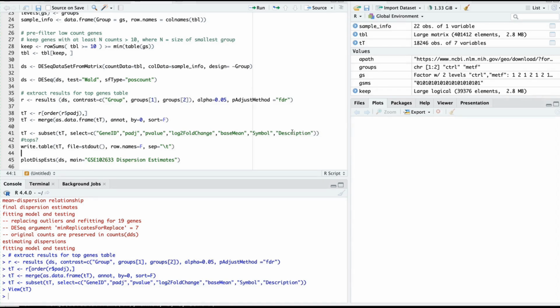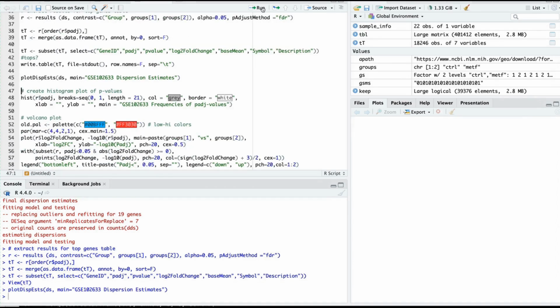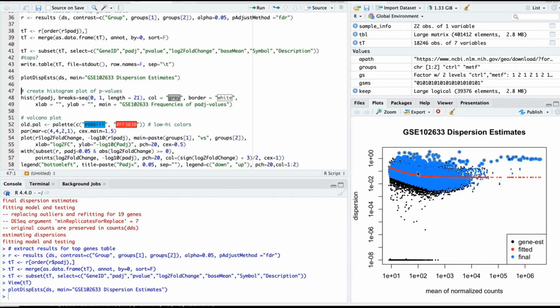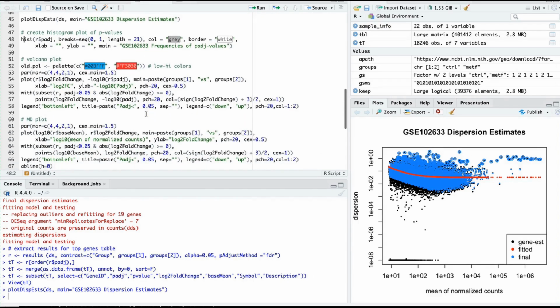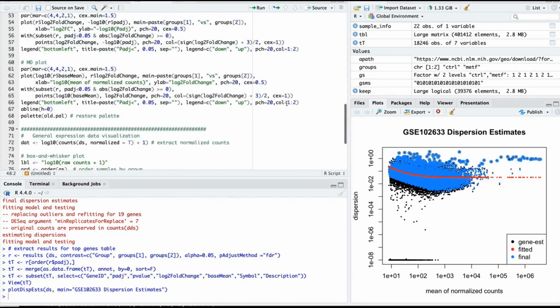From here you can further study the script, improve it, add plots and illustrations. Well, we can do it. That's a dispersion plot. Again, what is dispersion? You have to write the question mark and you will see it. And basically for the rest you will repeat all the pictures which you have seen online one to one. And then you can select what you really want, what you don't want.